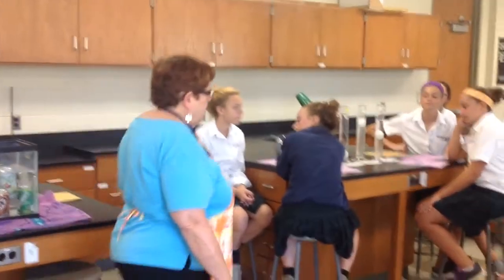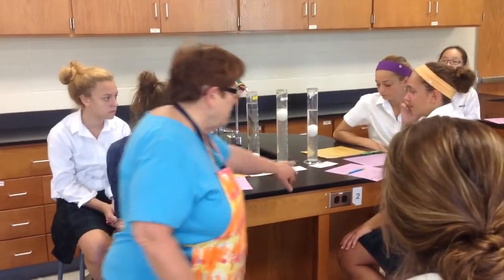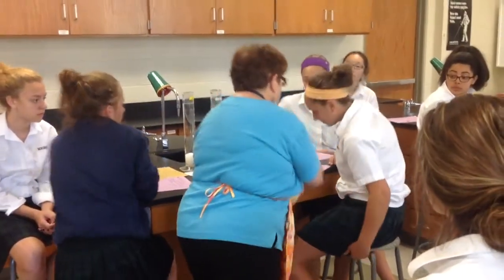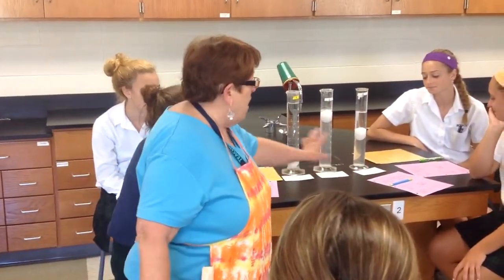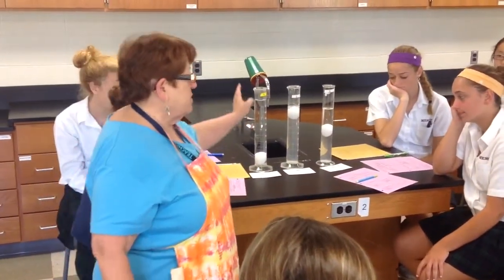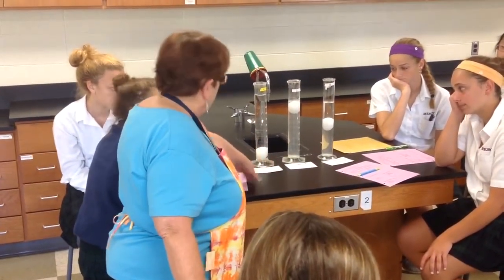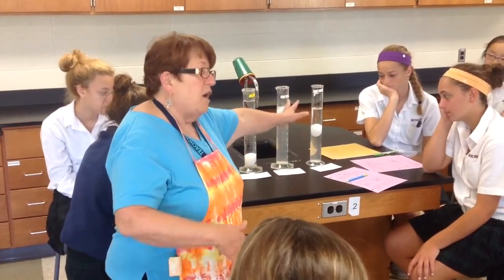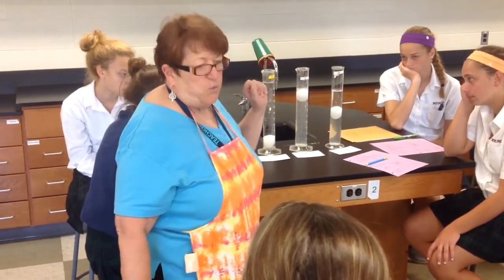Station 2 is the one with the eggs here, and two groups can be here at any time. You should be around that side of the table. And just read the directions about the eggs. Do not touch the cylinders or touch the eggs in the cylinders. There is tap water in the first one, I believe. Then salt water, and then an unknown something in the last one. So just watch, record your answers.